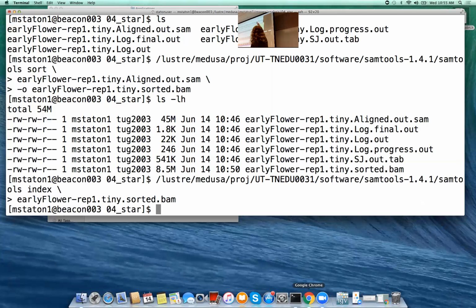The top 2 boxes are a little tiny sample file that we were using for the class so that everything would run fast. This is a much, much bigger sample file with 10 times as many reads. So your normal data would look like this. That's what we've been using for class data. So you're good. You're looking at the right thing.